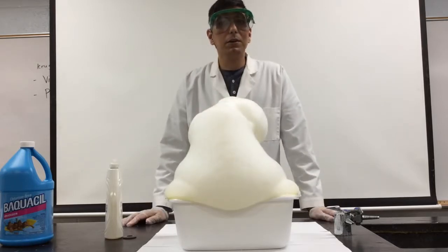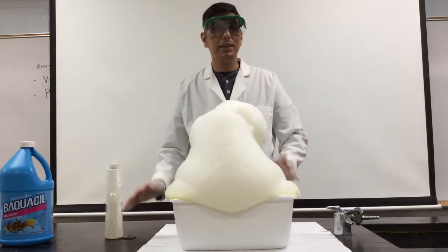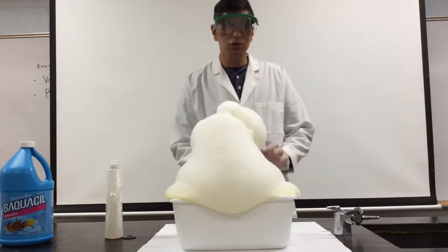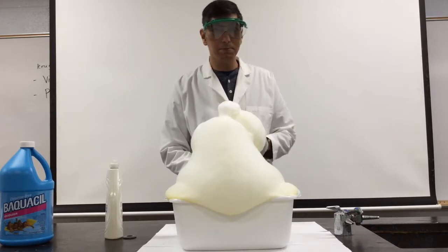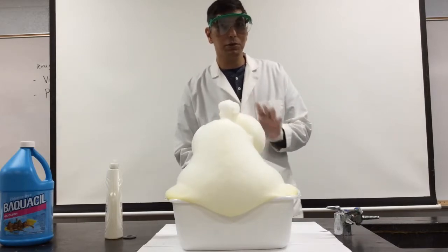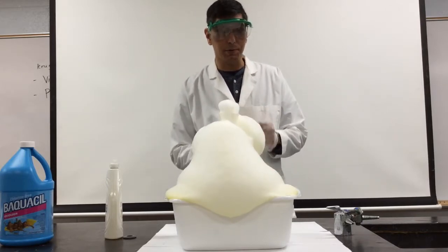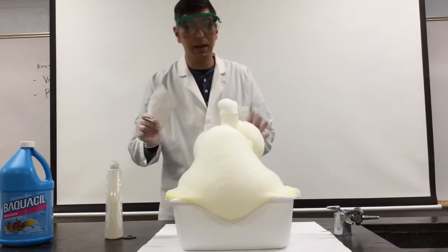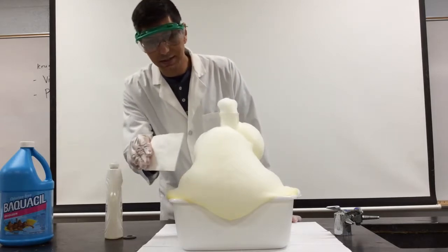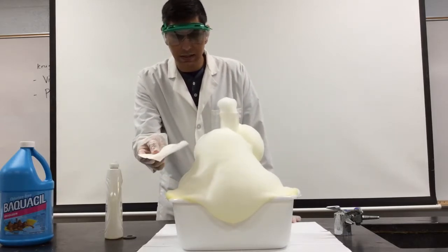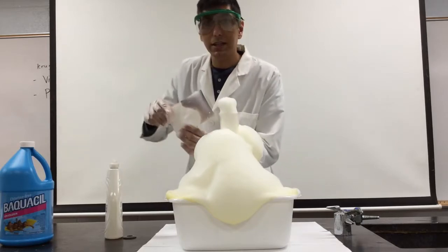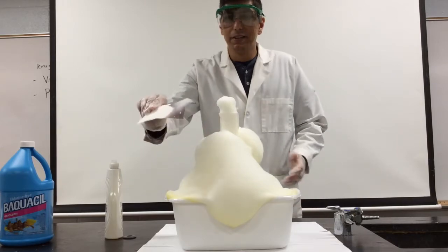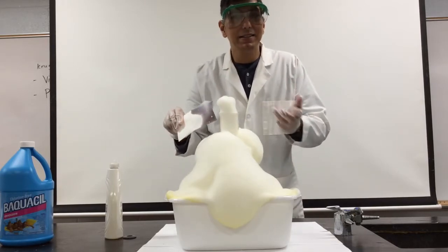One of the characteristics of a catalyst is that it's the same at the end as it is at the beginning. So that means there should be some potassium iodide here in the tub. I know that iodide will turn a piece of paper purple because iodide reacts with the starch in the paper. Let's see what happens when I touch the paper to the suds. Look at that — it turns the paper purple. So that means the iodide is still here.